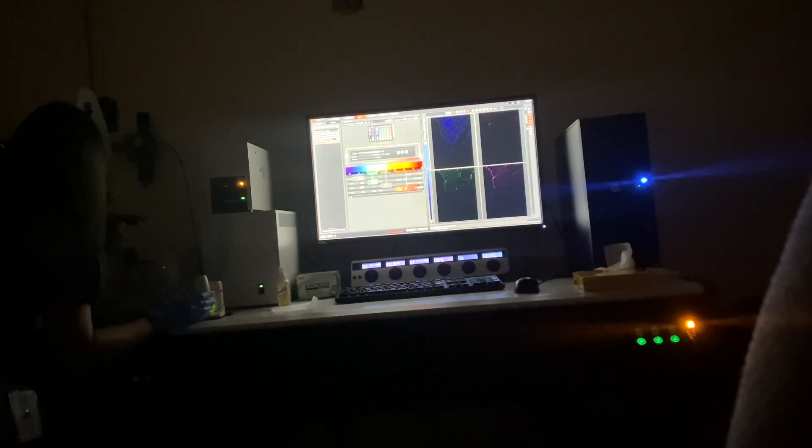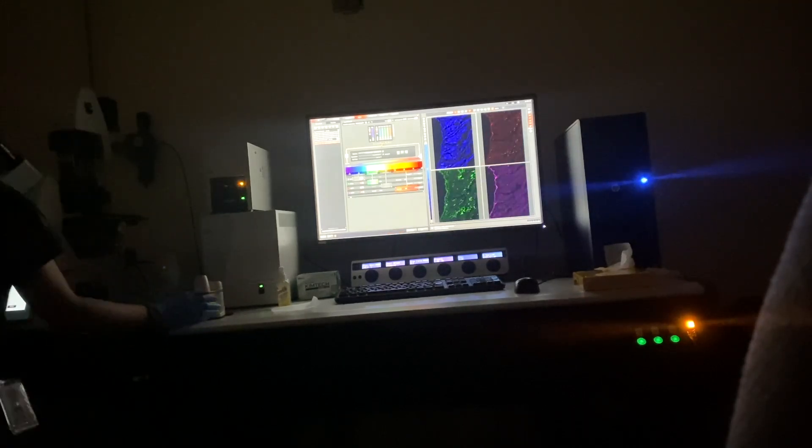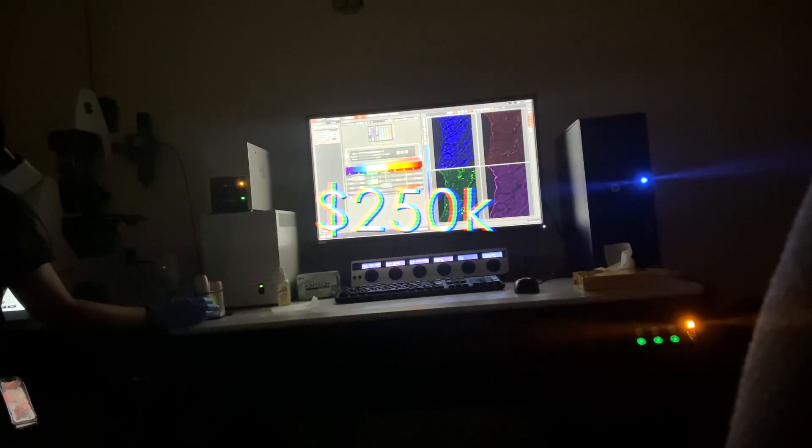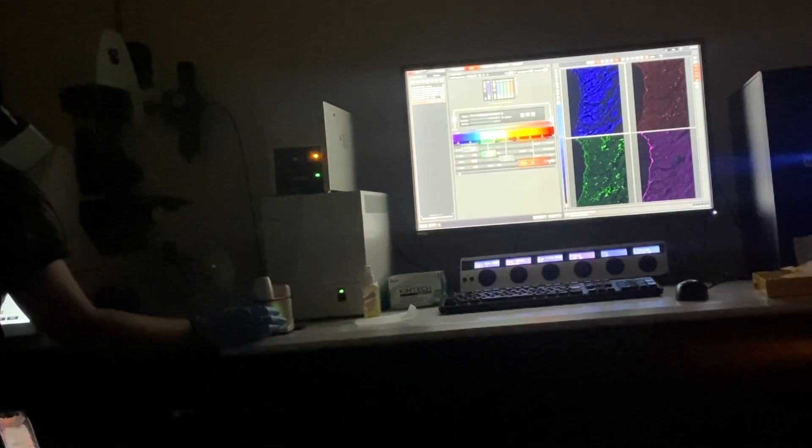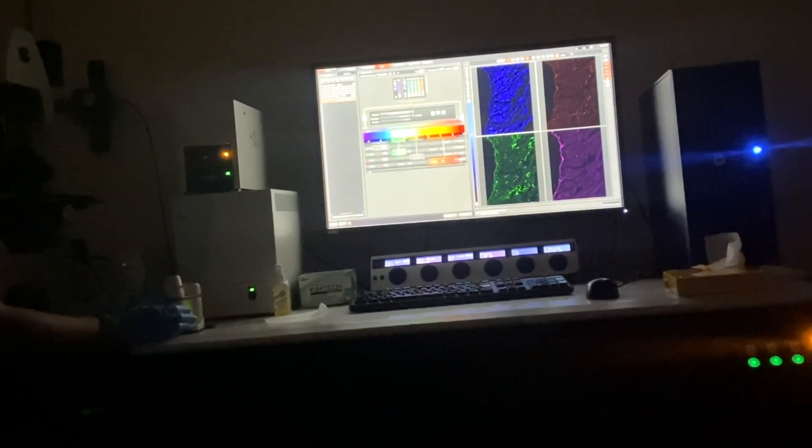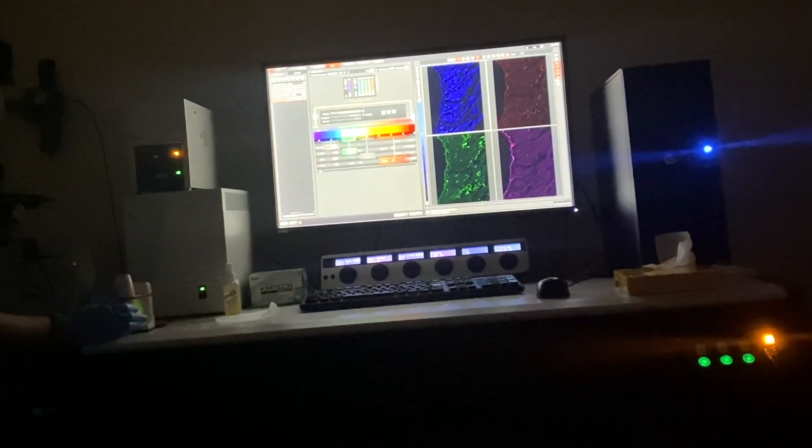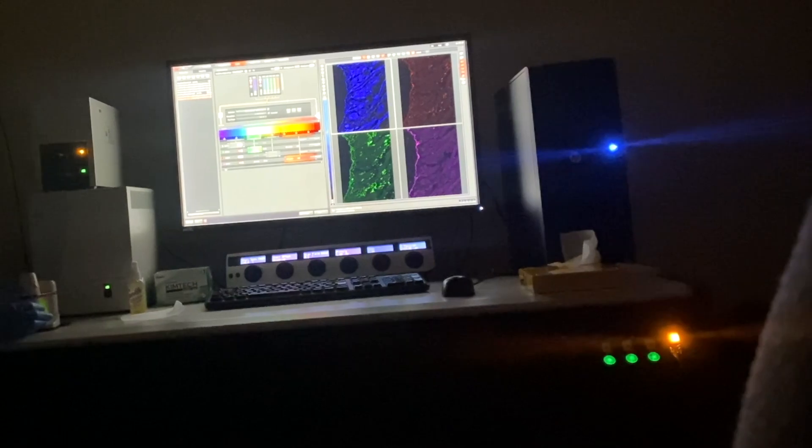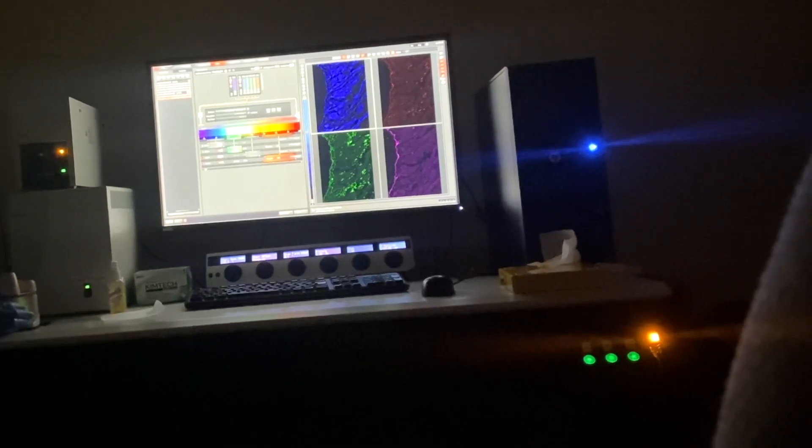This microscope setup was probably around $250,000 plus maintenance. So it's at a core facility or a shared resource where multiple labs or researchers can rent time on the equipment and basically share the cost.